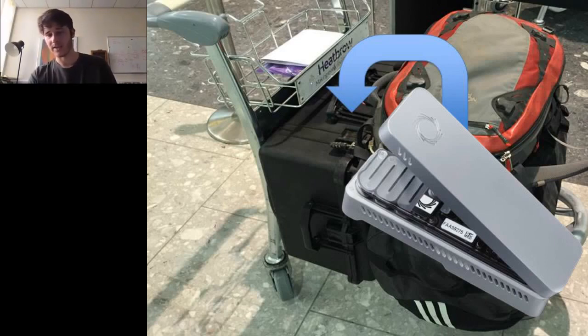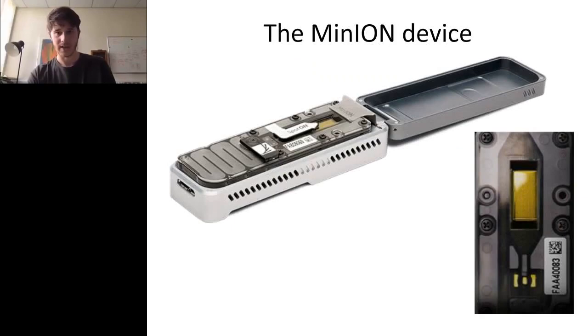It's also relatively cheap. The flow cell is actually a disposable consumable, which now allows us to analyze these samples relatively cost efficiently. So that's going to be the first thing that you pack in your mobile lab.